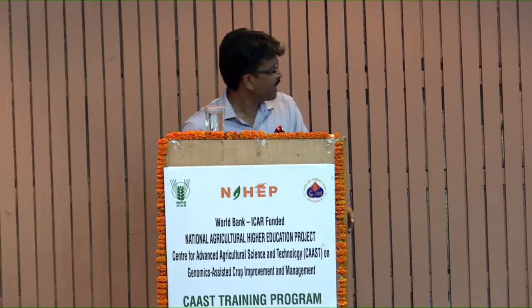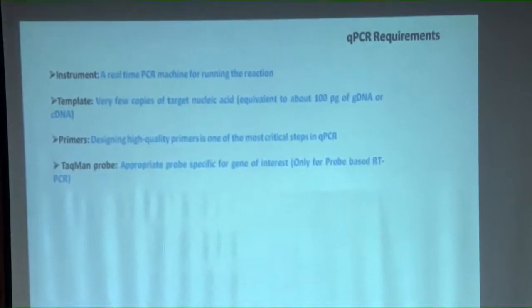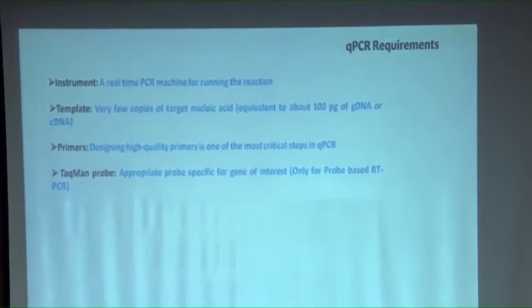So it's quite possible nowadays. So have a specific primer that would solve the non-specific problems you may encounter in SYBR Green based qPCR, right? And TaqMan probe, of course, if you are tech savvy and you want to go for very specific detection, then you need to have another target, another sequence designed from the same target, and you go for probe making by ordering from a company to convert this sequence into a kind of probe.